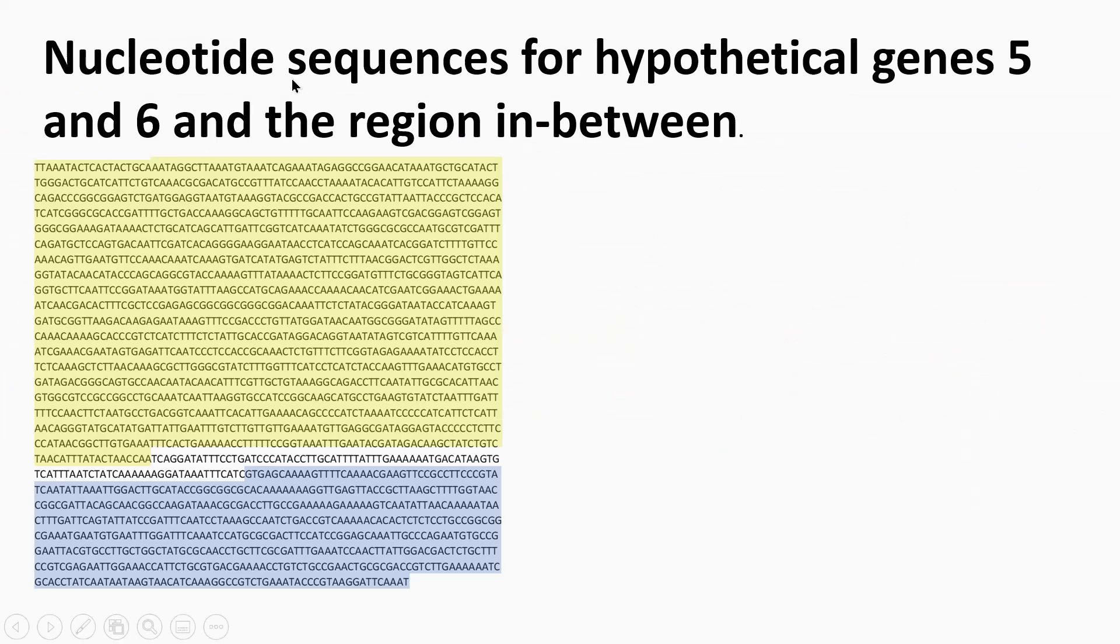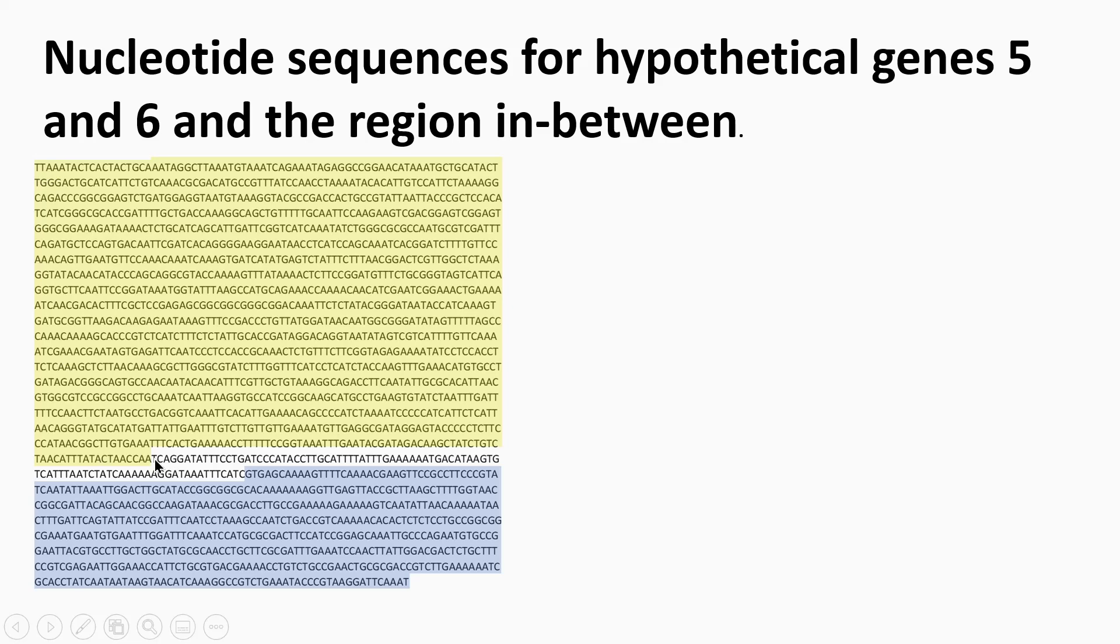What I did was I snipped out of the FASTA genome sequence, this region. As you can see here, I've got TAA here. So this is hypothetical gene five. And then you've got your TTG here, GTG for hypothetical six. And the stop codon is down here for hypothetical gene six.